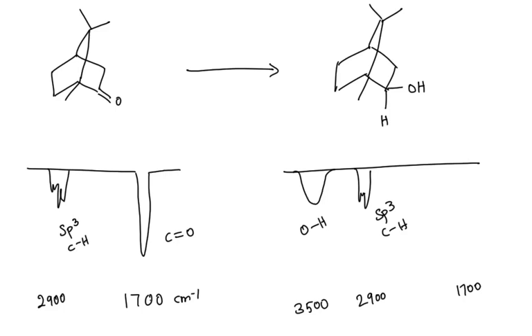In your IR spectroscopy, some of you cannot see the hydroxide peak. I tried several times. I couldn't see the hydroxide peak in the IR spectroscopy. You may see a tiny, a small dip like this, but not much. I couldn't figure out why.